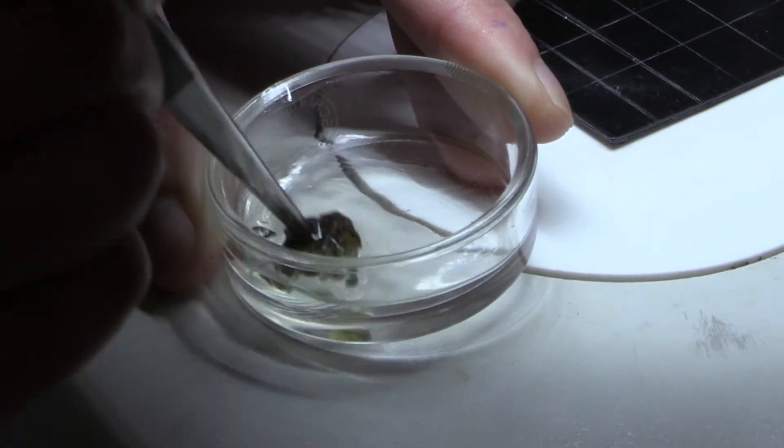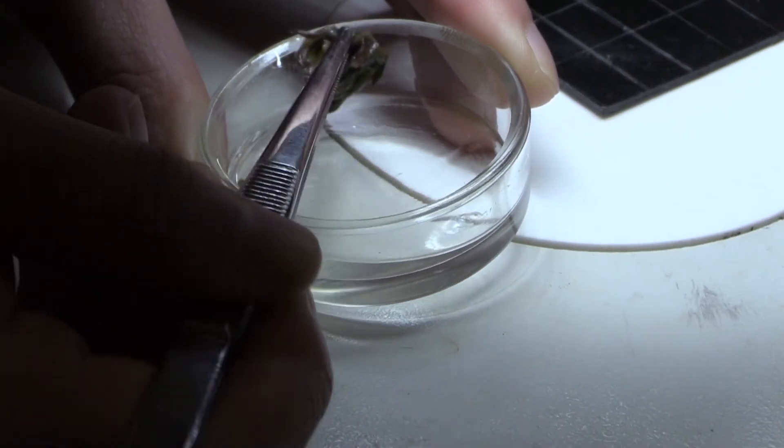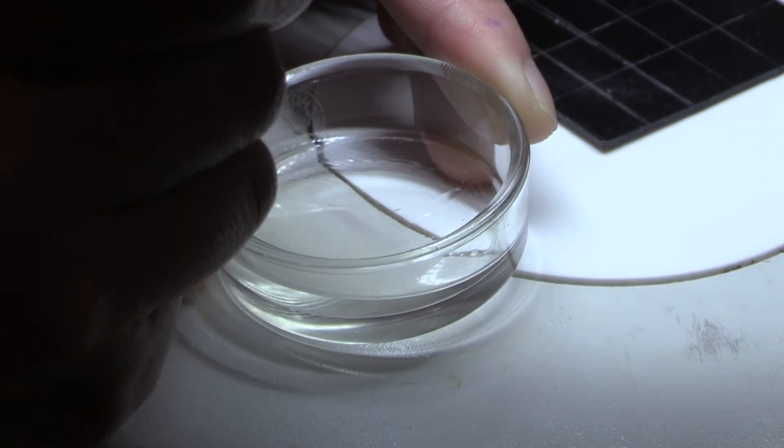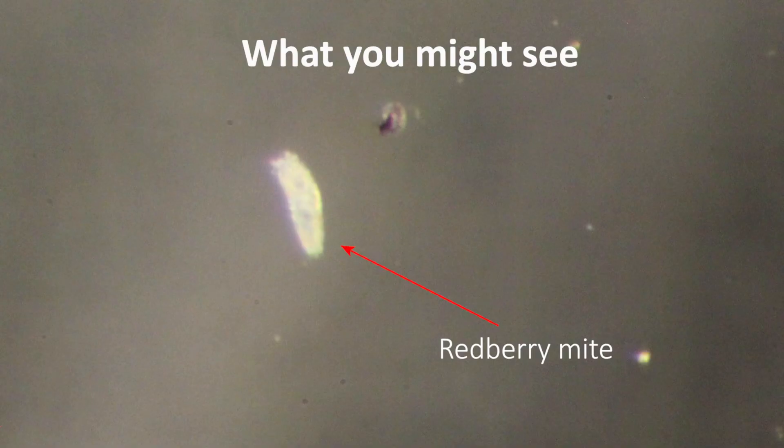Once we've done that, wipe off the excess ethanol and leave it in the dish, then stick it underneath the microscope. When you're looking under the microscope, this is what we're really looking for — a little white blob. They're pretty innocuous, but they look quite different from predatory mites and other mite species like two-spotted mite. It's a little worm-like mite, and sometimes if you can see it moving, you can just see them there. The legs poke out of one end, so they don't come out like a spider mite does. So you're just looking for this little worm-type thing.